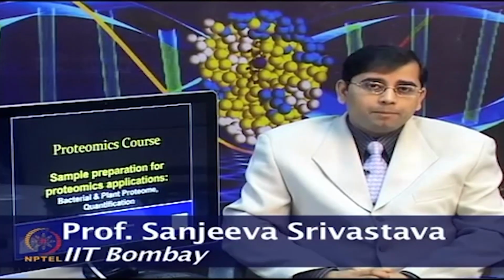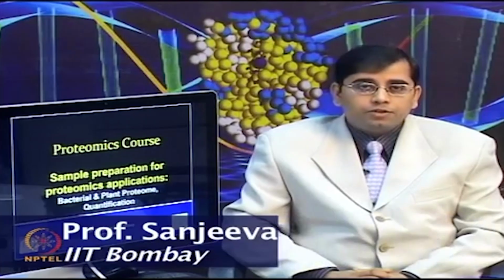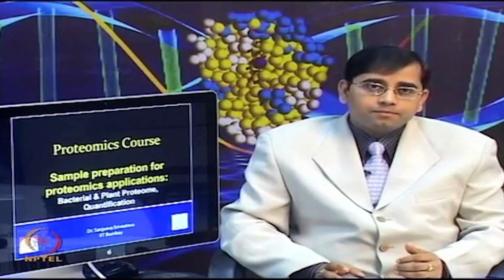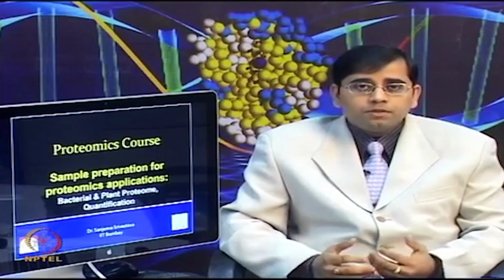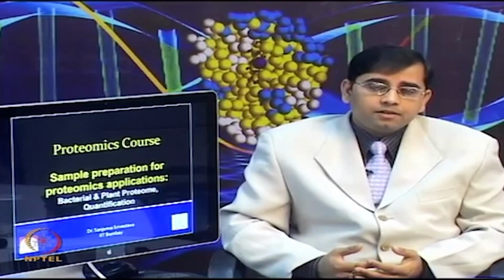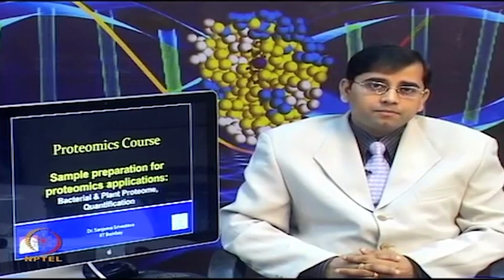good protein sample preparation for proteomics applications. We talked about different types of lysis methods. We talked about how to prevent proteolysis during the lysis, and different types of protein pre-fractionation methods.